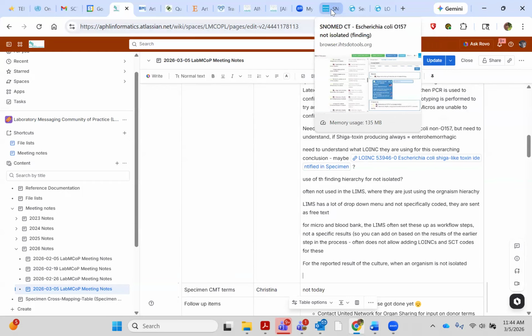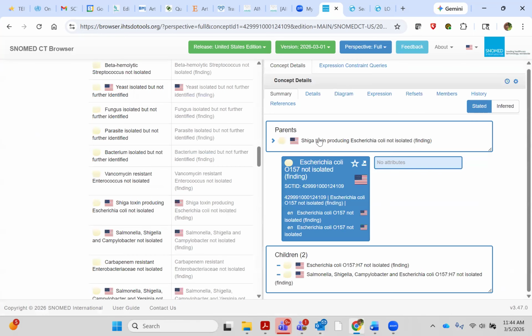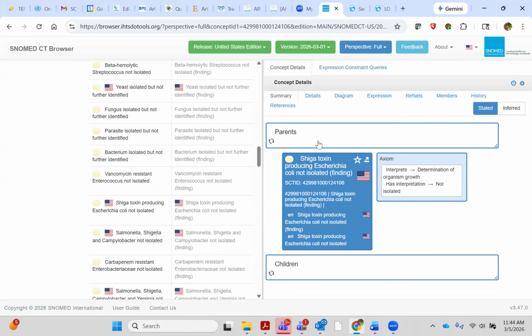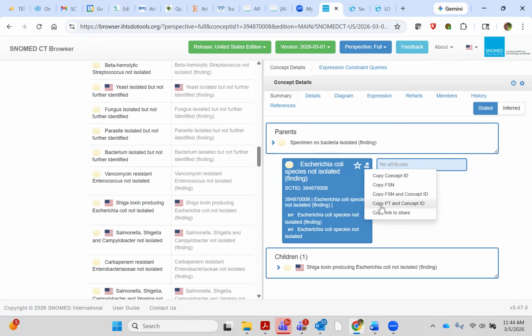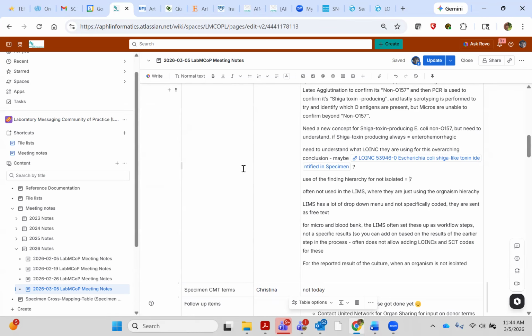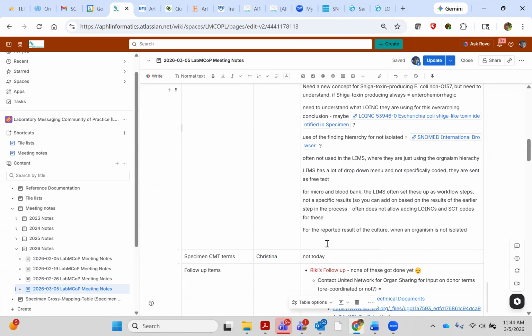And it's the same thing when we were talking about susceptibility testing. In HL7, I don't know if you were on, we had some Shield calls. I know Jim Case was on. They said, if you're reporting this in HL7 V2 and you're putting the interpretation, like sensitive, resistant, intermediate, in the OBX8, which is considered the interpretation field. And Rob Hausen was on too, because they're looking at interpretation as that specific field, not that the interpretation can also be an OBX5.